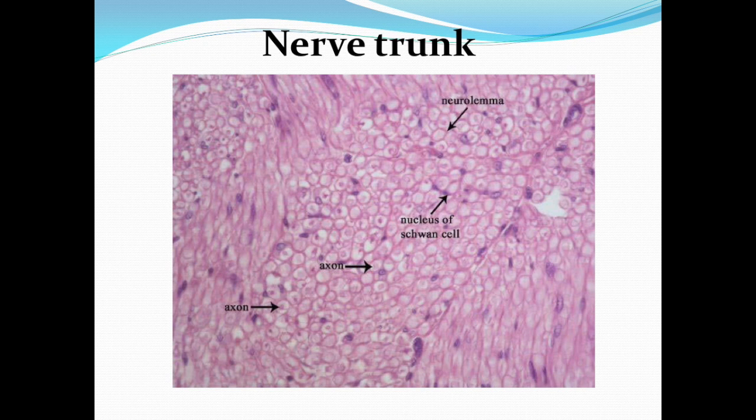This is also another picture for the structure of the nerve trunk. Here he is magnifying the nerve fibers. In this picture you can diagnose that we have the nerve fiber like this, and in the center we have a faintly stained axon, and this area here should be the place of the myelin sheath, but as it dissolves during preparation of the section in alcohol, we have only the framework which is called neurokeratin.